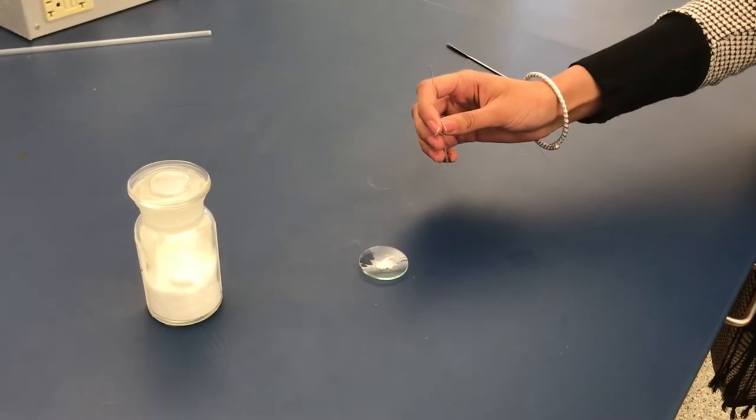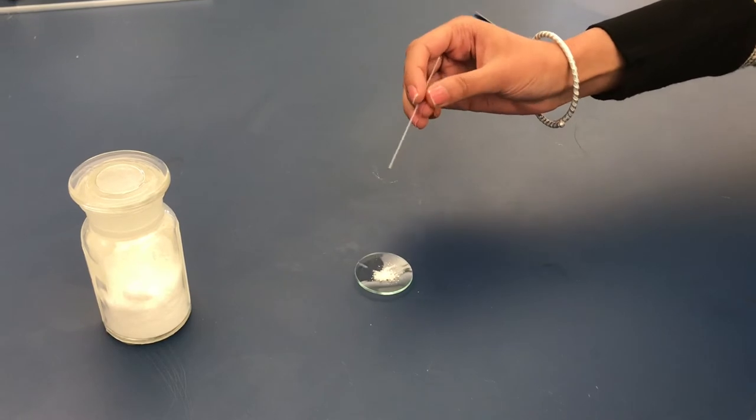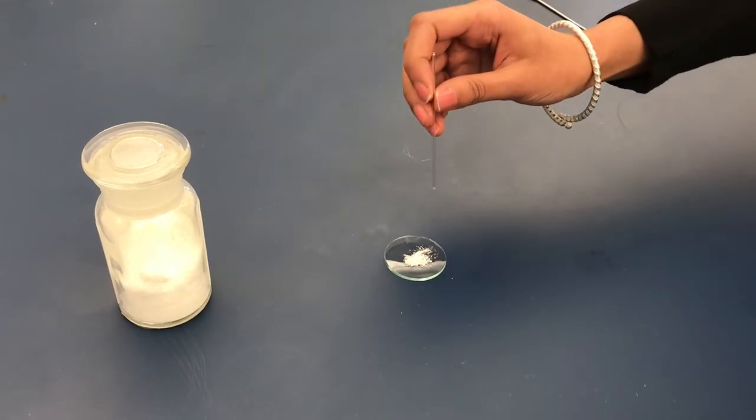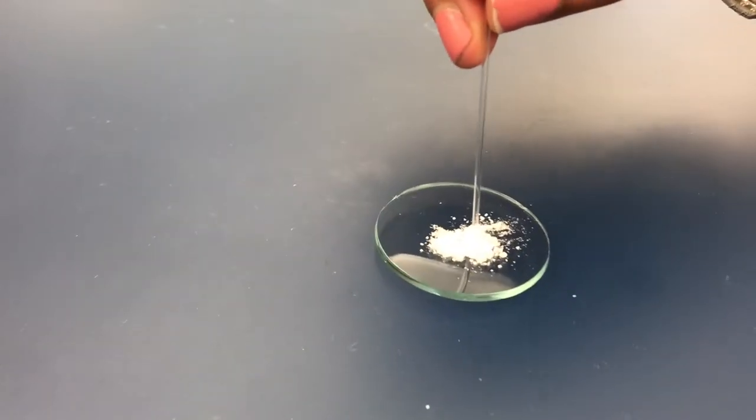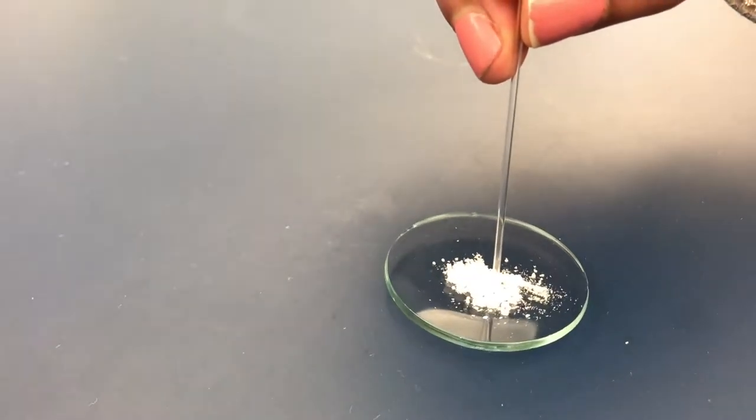In order to load the solid into the capillary tube, turn the capillary tube so that the open end faces the solid and gently press the capillary tube into the solid. Only a small amount of solid is required.